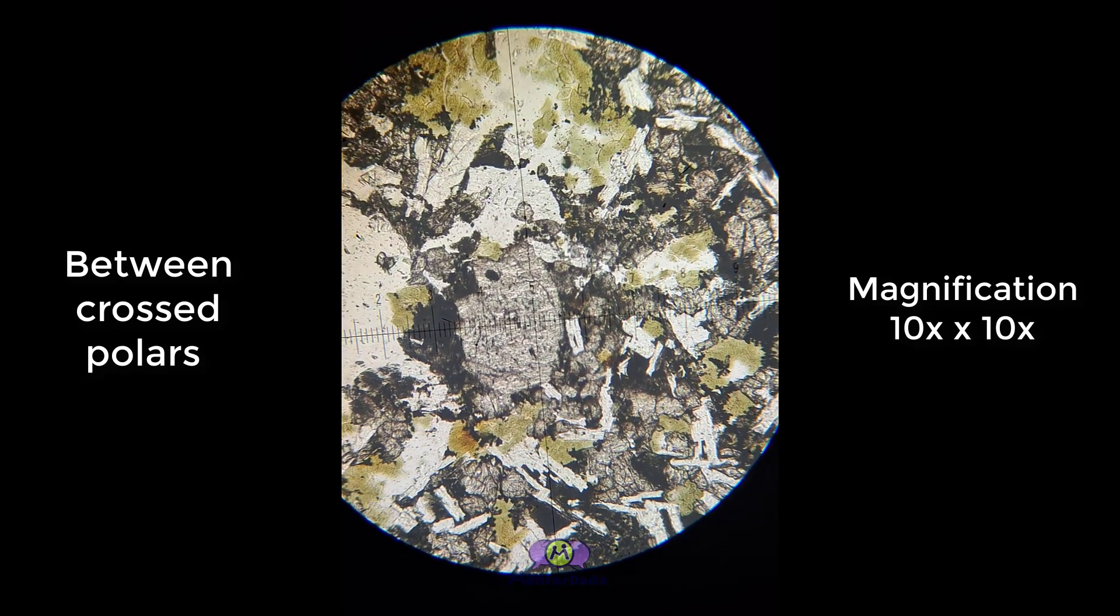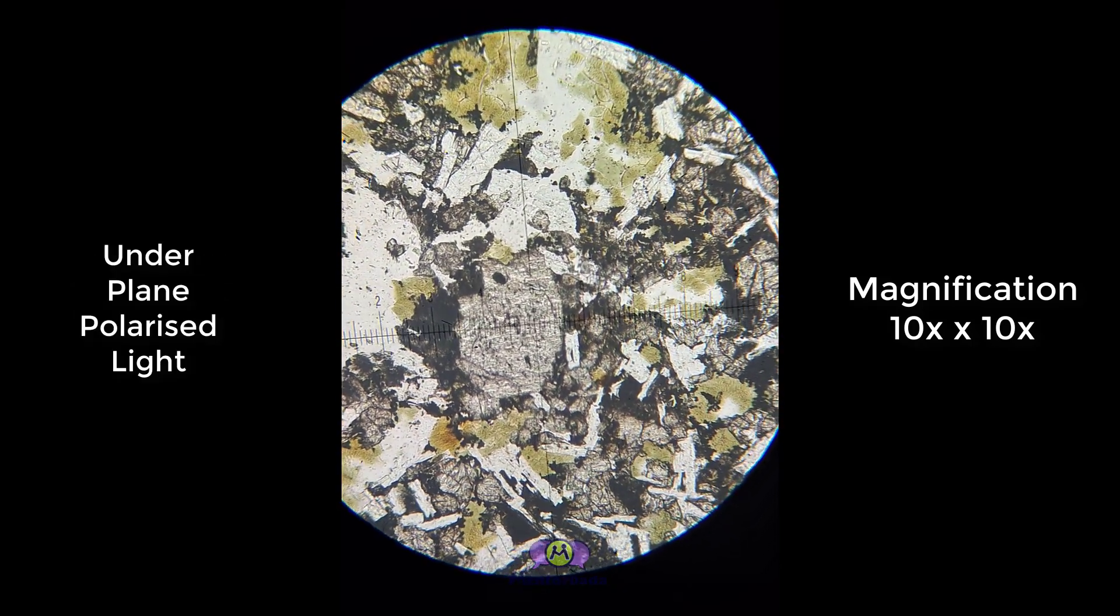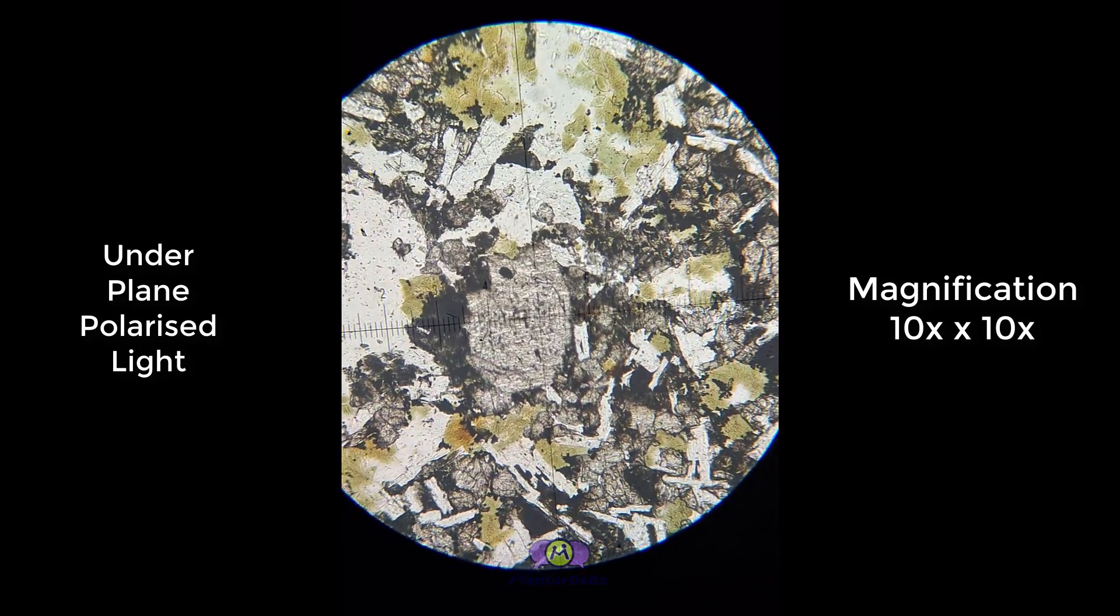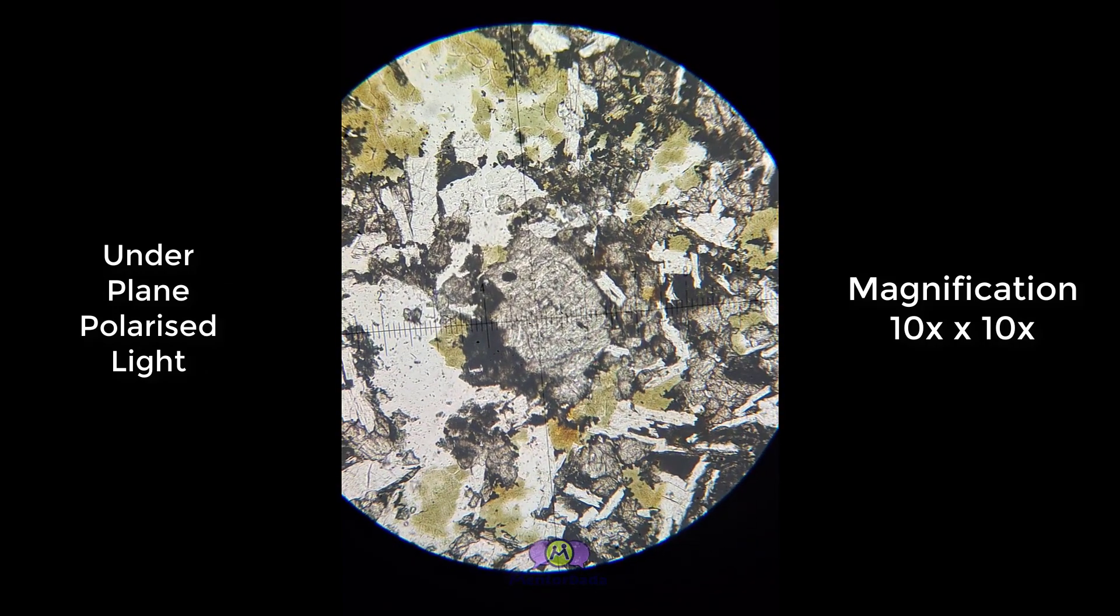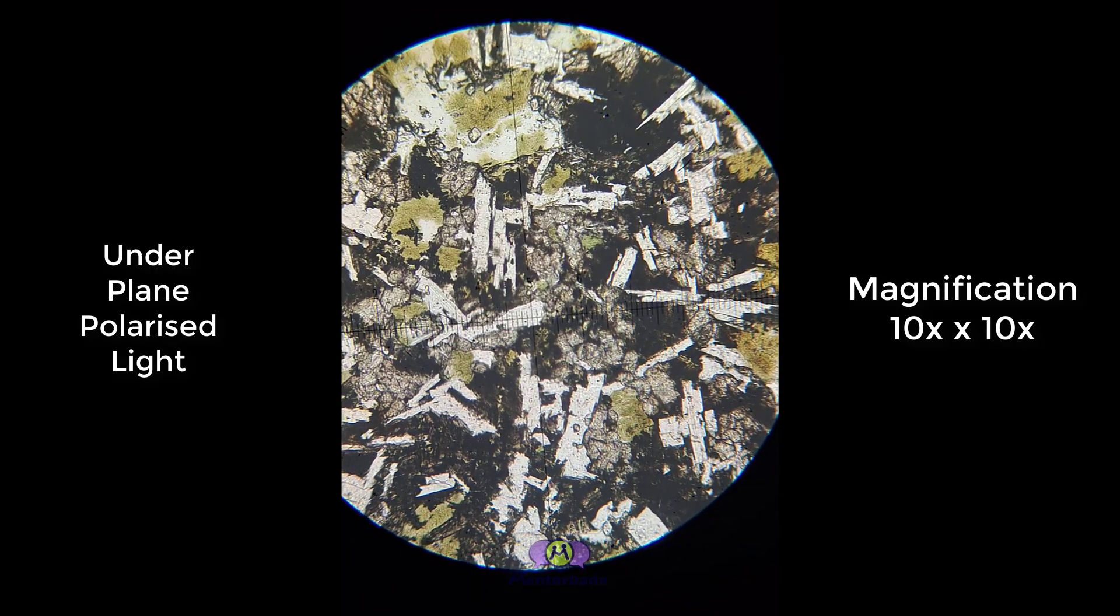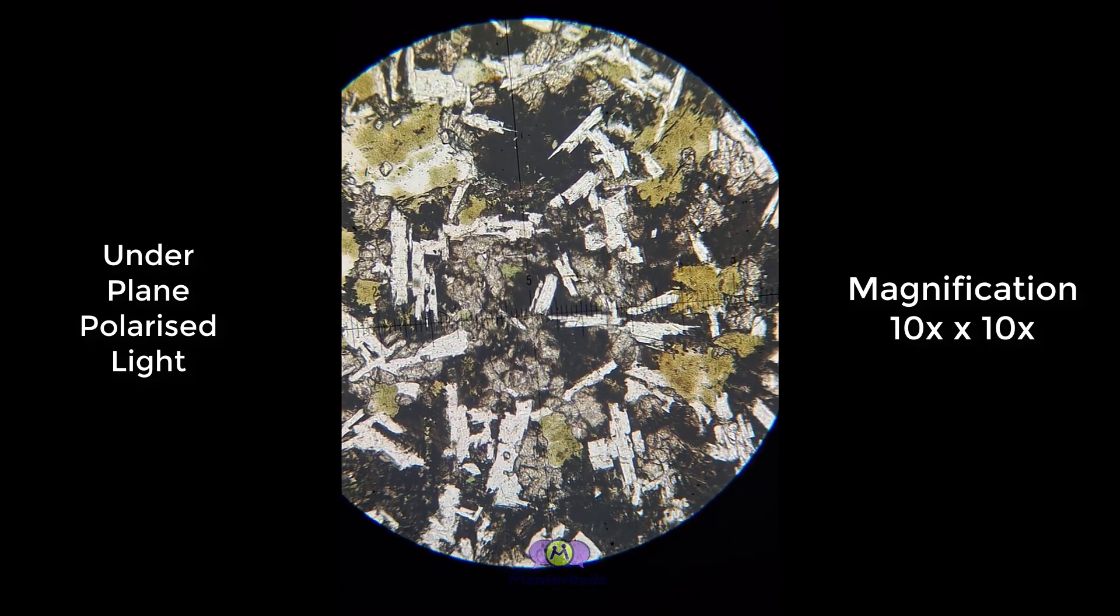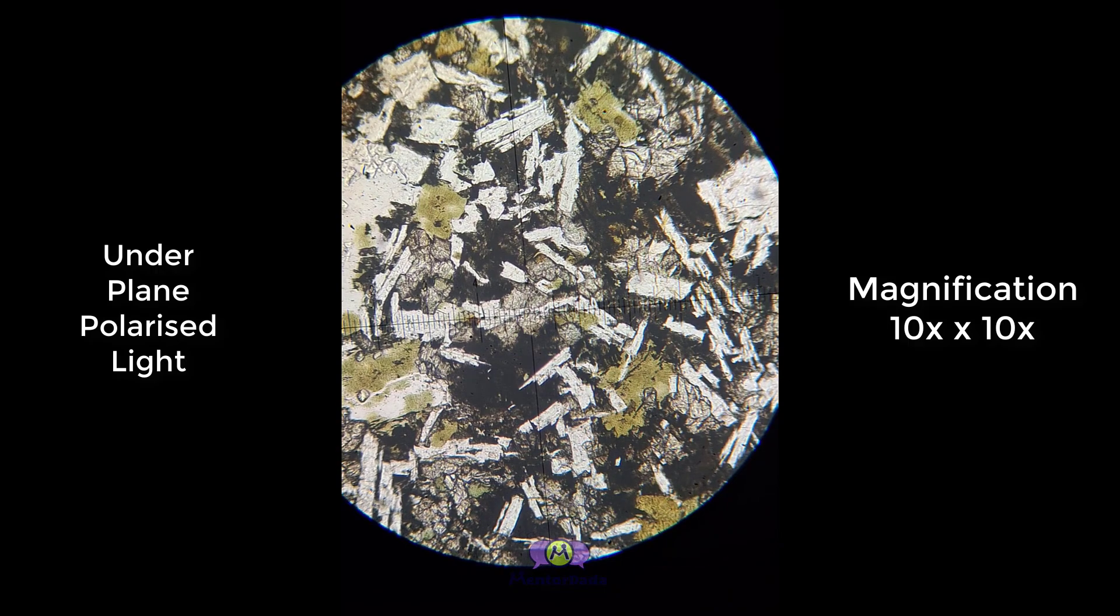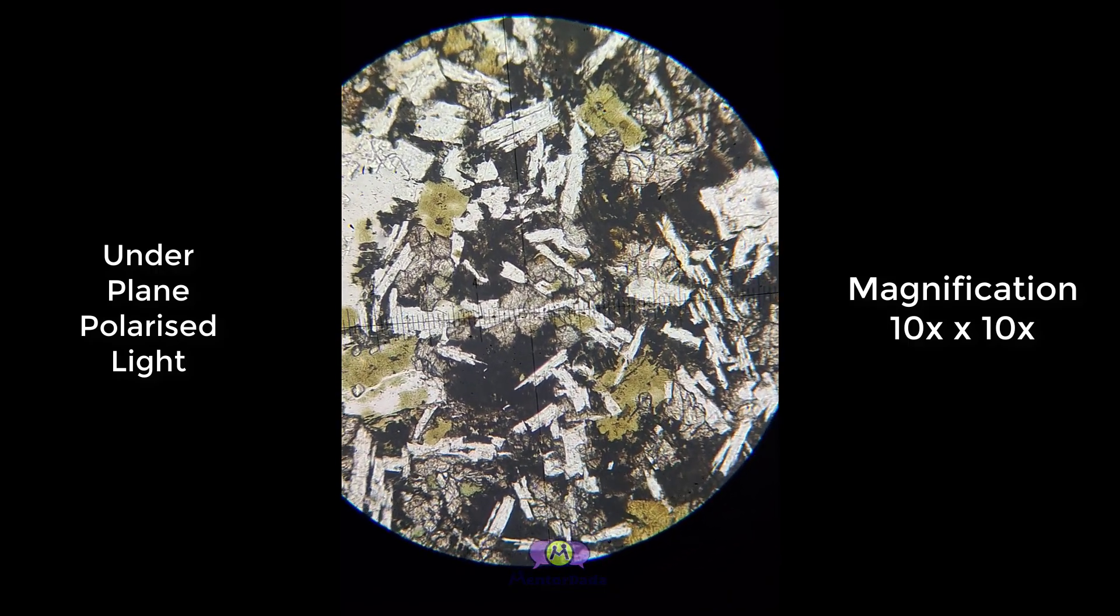If you look in plane polarized light, this mineral is showing high refractive index. These are all pyroxenes. A lot of pyroxenes are there, and the pyroxenes are colorless, relatively showing high refractive index.